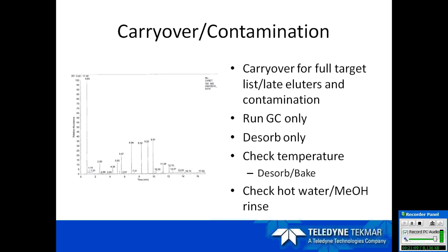For many of you that have older systems like the LSC 2000, and some of you that still have it, you'll remember that we tended to have high bake times on those, upwards of 10 to 12 minutes. Mainly that's because of the type of tubing. We used nickel tubing back in the day, and you didn't have as much control over the flow. You would have to set your bake flow to what your purge flow was, which is usually 40 mils a minute.